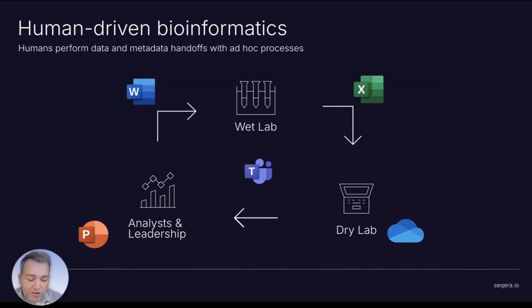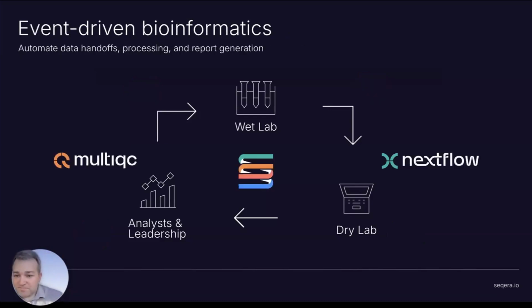Now, if we want to convert this human-driven process into an event-driven process, there are some open source and commercial tools from Seqera that will be incredibly useful in making this far more reproducible and scalable. And here I've mapped out some of the core ones that we can replace with event-driven processes.